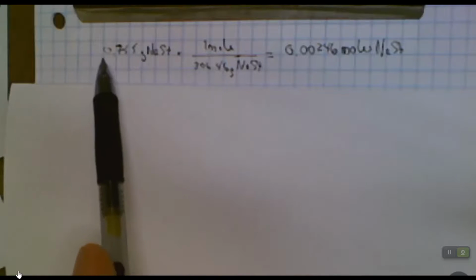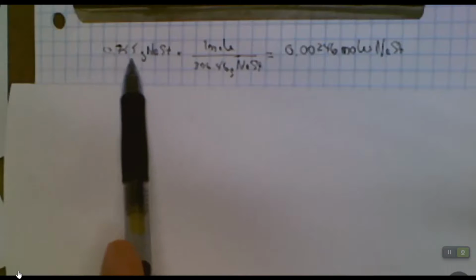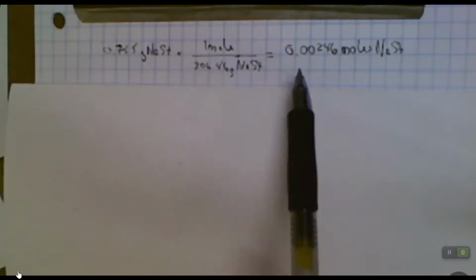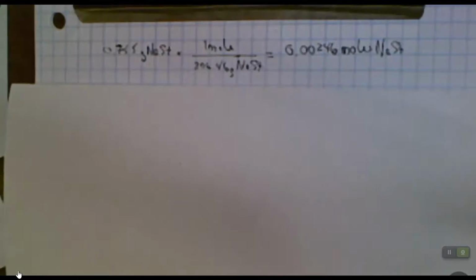So if I take the grams of sodium stearate that we started with, divide that by the number of grams in 1 mole, that will give me the number of moles of sodium stearate that I have in that whole 500 milliliter volumetric flask.